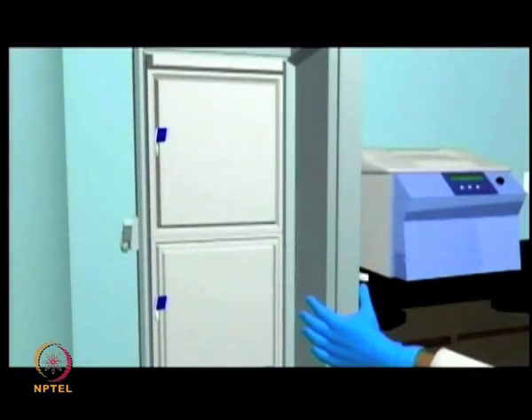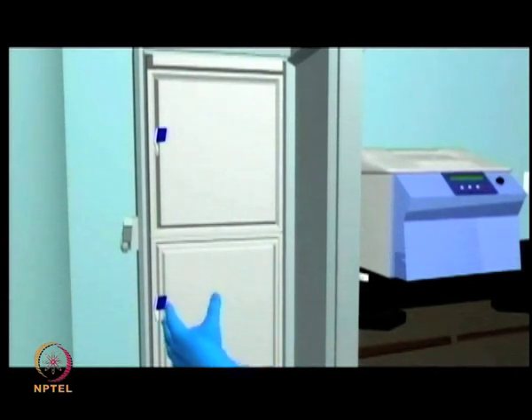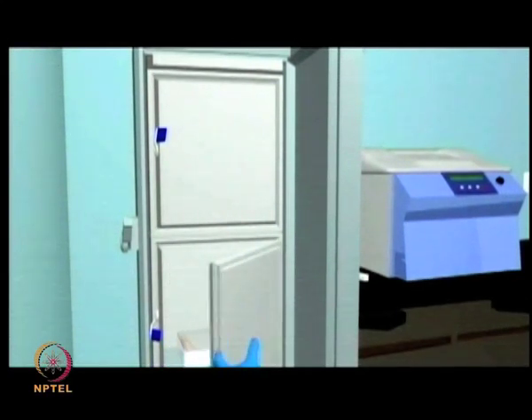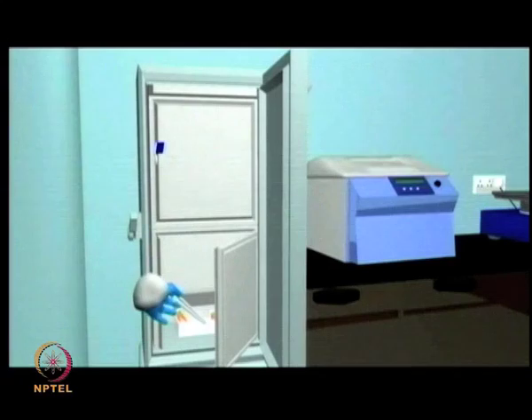So, here I am giving you an overview of a protein microarray experiment. Regardless of what application one wants to study, the overall workflow of protein microarray experiments remains the same. Here I am showing you an experiment of protein interactions performed on the E. coli proteome chip. First of all, these chips are stored at -80 degrees. If they are purified proteins, you want to store them under very freezing conditions, so that the protein can remain functional.